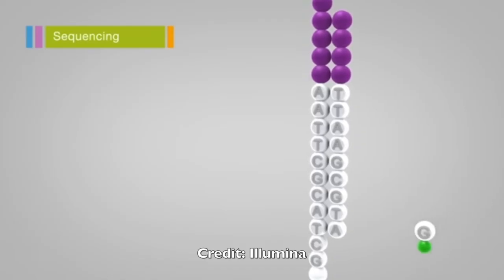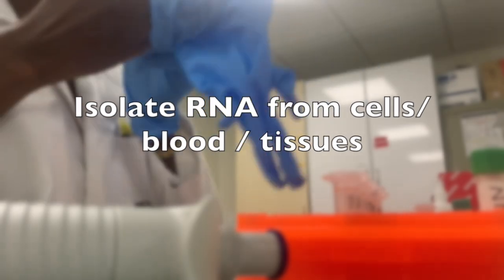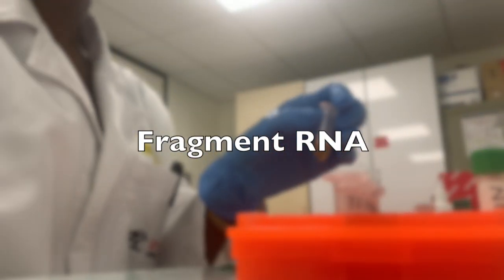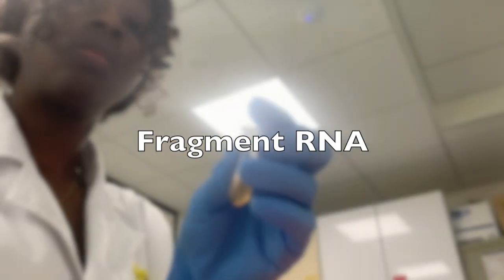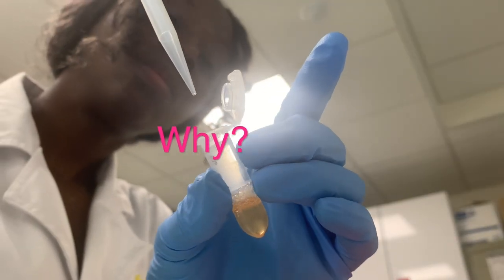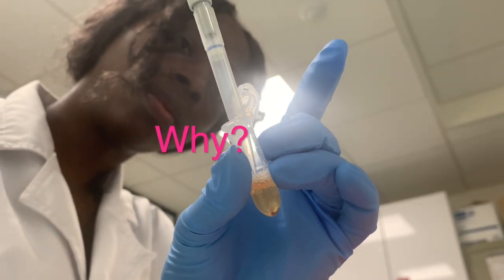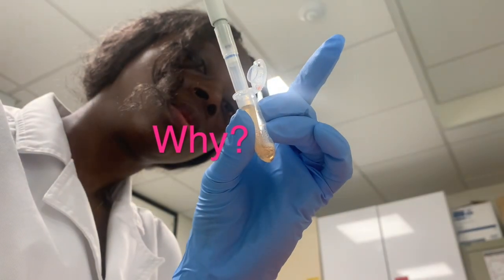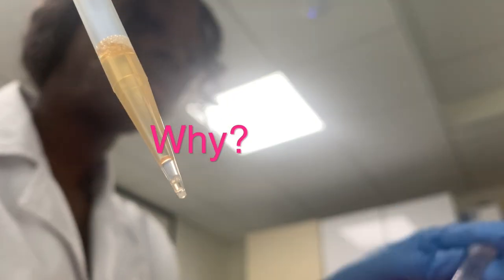So just like the other methods, you will have to isolate the RNA. That's standard. But there's something different here where you have to fragment the RNA into short segments, and then you convert these segments into cDNA. Do you know why you have to fragment the RNA before you make the cDNA, versus when we were using the northern blot, or if you're trying to do qPCR, why in qPCR you never have to fragment the RNA? If you do, let me know in the comments.